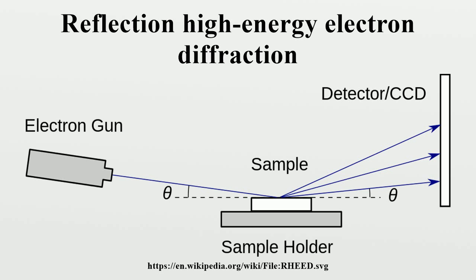Surface diffraction. In the RHEED setup, only atoms at the sample surface contribute to the RHEED pattern. The glancing angle of incident electrons allows them to escape the bulk of the sample and to reach the detector. Atoms at the sample surface diffract the incident electrons due to the wave-like properties of electrons. The diffracted electrons interfere constructively at specific angles according to the crystal structure and spacing of the atoms at the sample surface and the wavelength of the incident electrons.